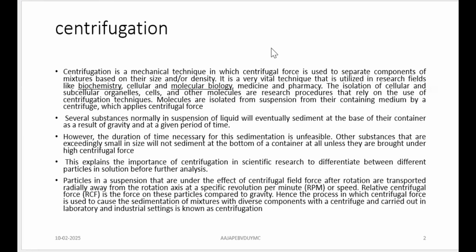It is applied to separate the components in a mixture based on size and or density. Only bigger size but less dense, then they won't be heavy as such, right? Bigger size and more density, then they will be heavier. So size and density are the two criteria which are going to be important.